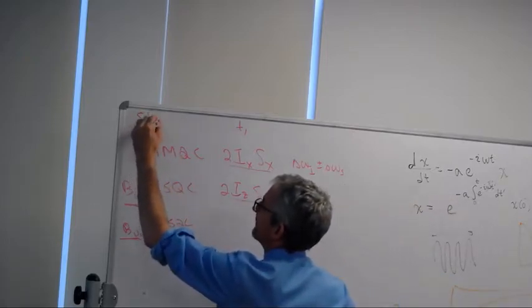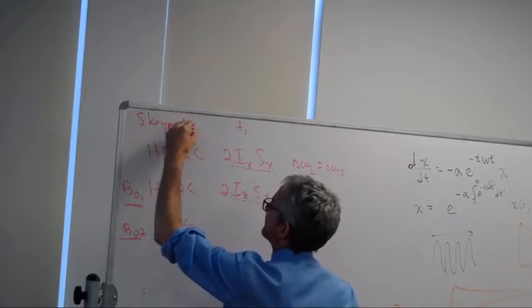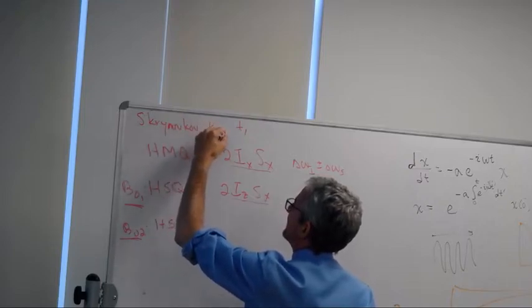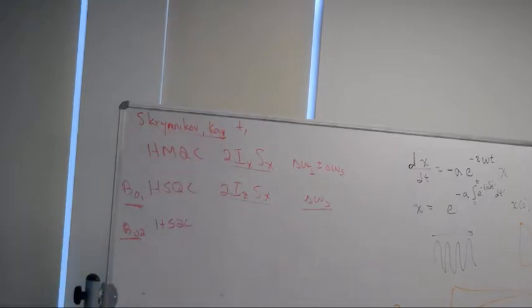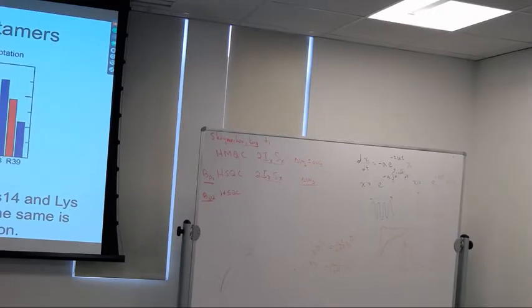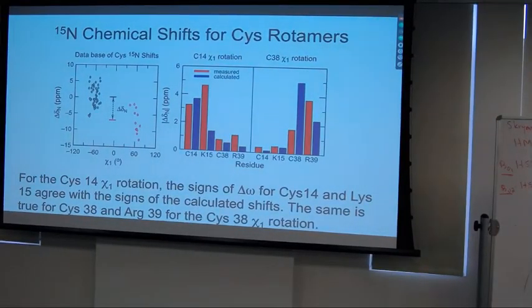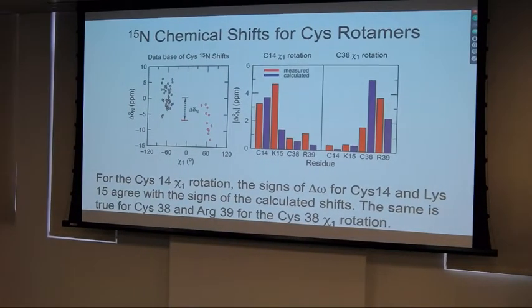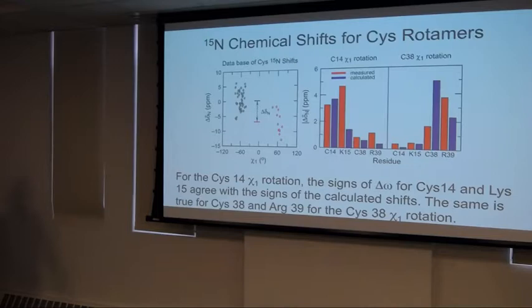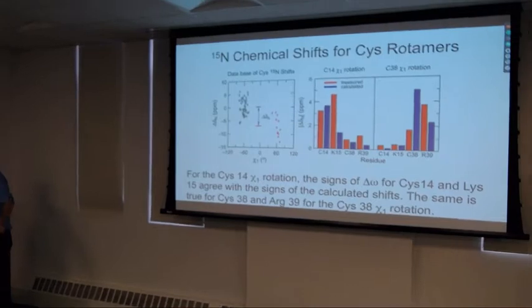And this is from a paper from Nikolai Skrynnikov, not quite a while ago. This is quite important because things can go very wrong if you don't know the sign of the shifts. We once had a very good correlation between the absolute value of delta omegas for BPTI, the data that I've showed you, with the shift difference between BPTI free in solution and bound to chymotrypsin.